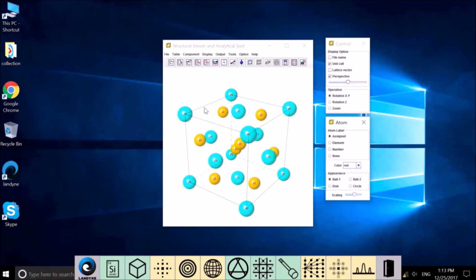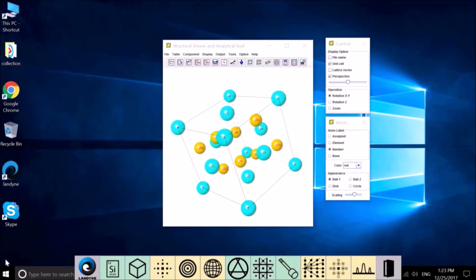Before, we used the periodic table to control each individual type. Now I'm going to show you how to add a bond between two atoms. For example, we select the atoms to show them with their numbers. So if we want to connect a bond between atom 32 and 260, you go to bond.